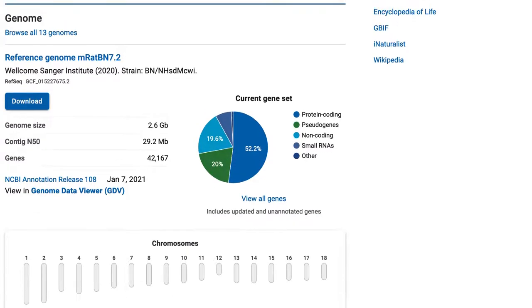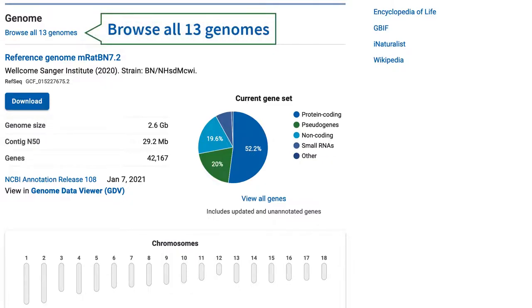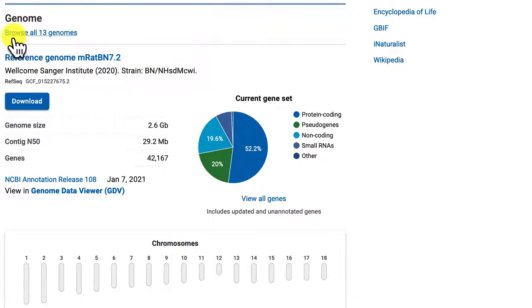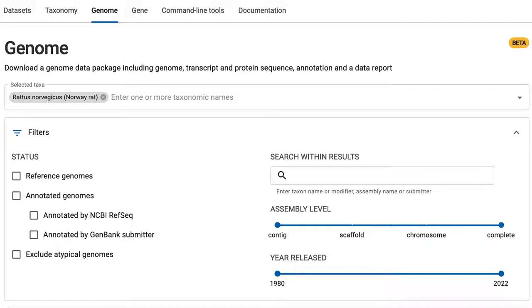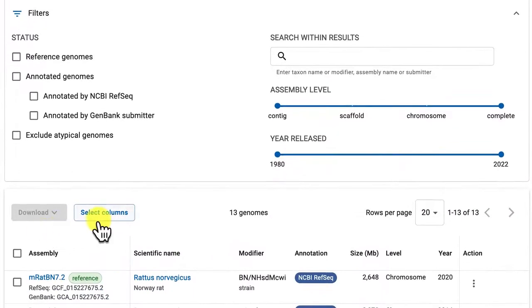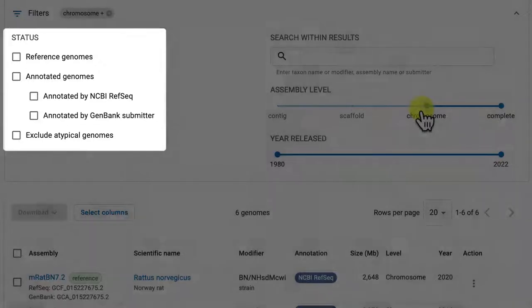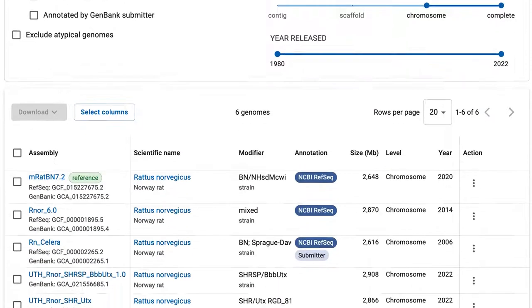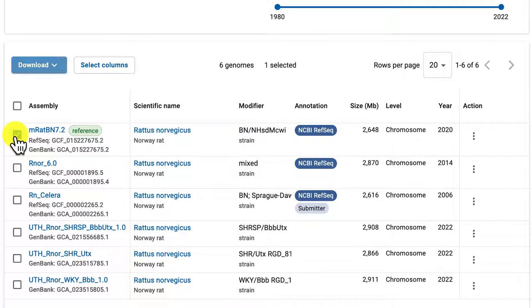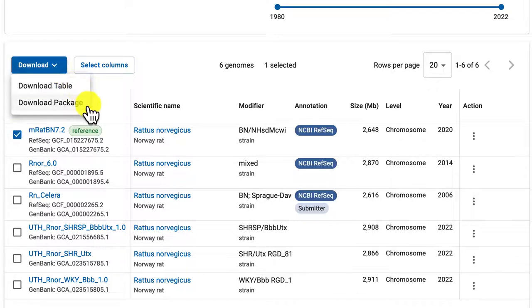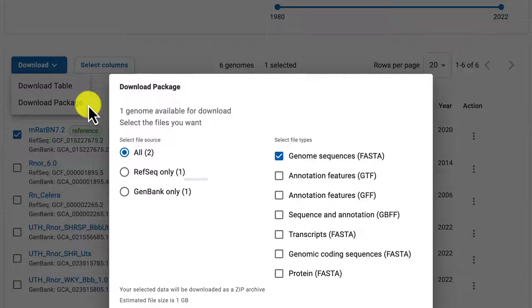Let's explore the genome table provided by the Browse All 13 Genomes link. Notice that you can select columns and apply filters to narrow your list, including new status options. You can download this table or a selected assembly dataset with the Download button menu, which now includes the option to select the source: RefSeq, GenBank, or both.